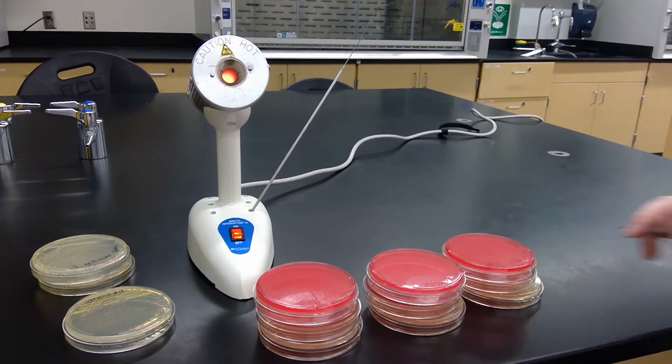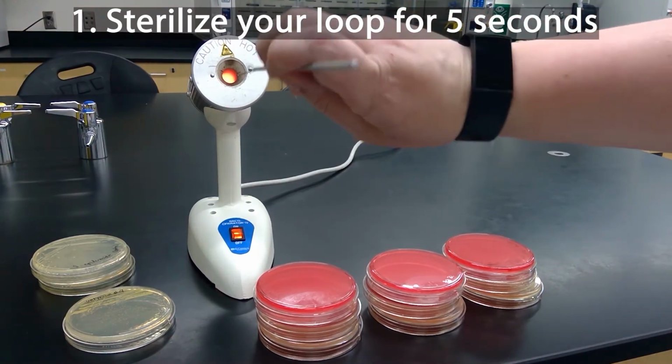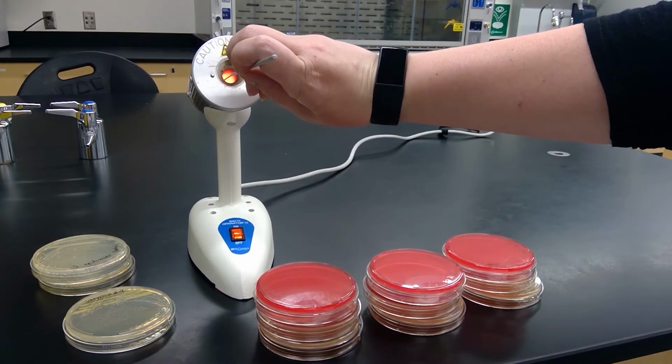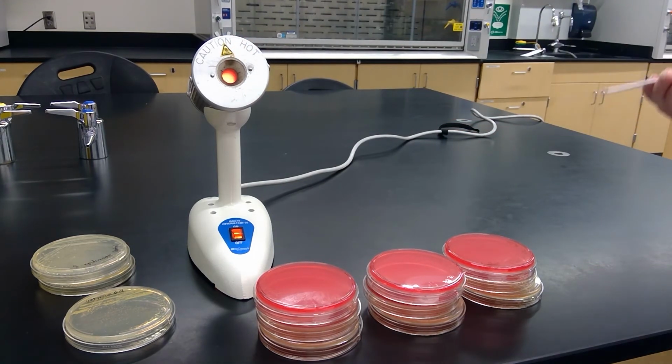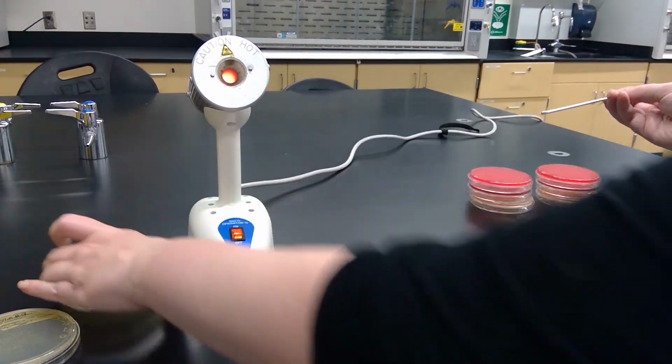All right, so all of our plates are labeled and now we're ready to transfer the cultures. So this will be very similar to the 4 quadrants streak, except for we're not doing the quadrants, we're just going to do 1 streak. So we'll want to sterilize our loop. So 1, 2, 3, 4, 5. And we'll start with the staph epidermidis.